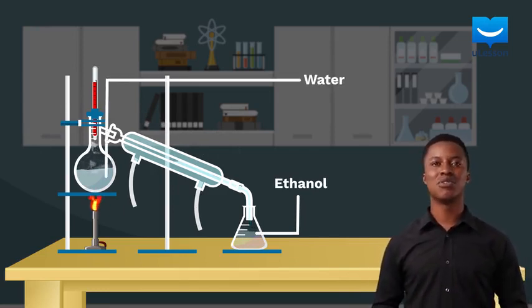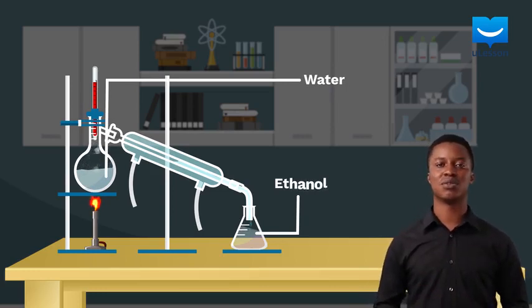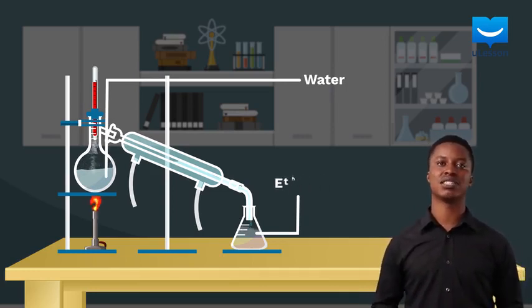Meanwhile, the water remains alone in the round bottom flask as the temperature would not have gotten to 100 degrees Celsius, so it neither boils nor changes to vapor, leaving the mixture separated. I'm sure that the next time you mistakenly pour water in your gallon of methylated spirits, you will employ the distillation procedure and separate them without much hassle.